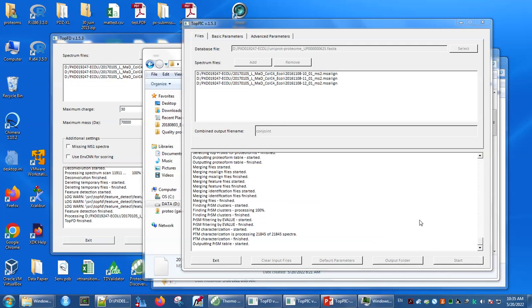I think you'll recall that in this case we've supplied methionine sulfoxide, the oxidation of methionine, and also the disulfide bridges as a PTM. So the software in version 1.5.3 allows each mass gap to be interpreted as any of the mass shifts that you've made available to it.